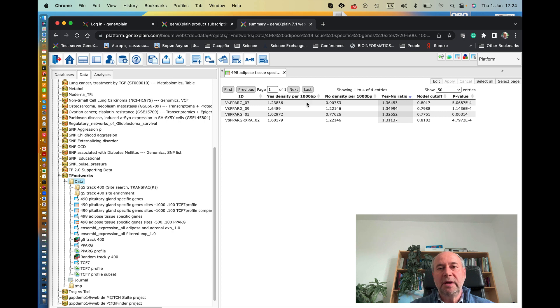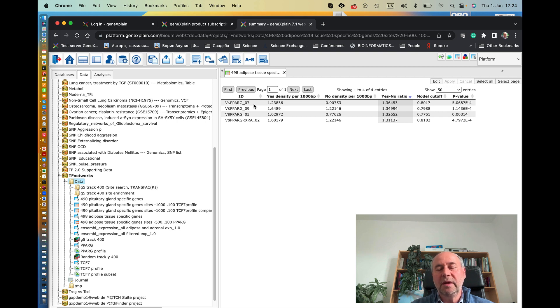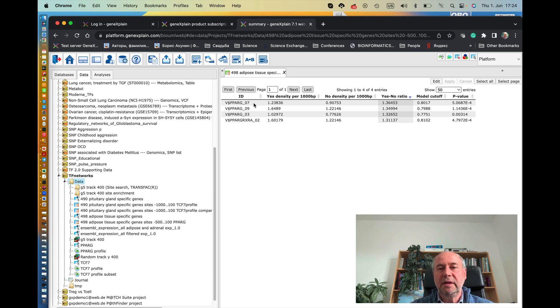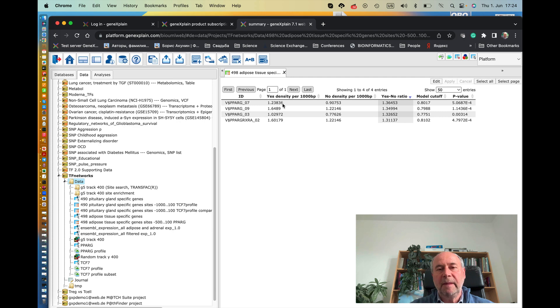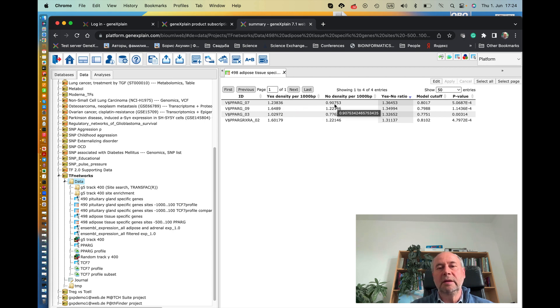You remember there were nine motifs. It found that four out of these nine motifs produce binding sites which are specific in the promoters of these genes. And for instance, this PPAR gamma 07 is very specific. So this yes to no ratio is 1.3 and p-value is 10 to the minus 4. So you can see this frequency of these sites in the promoters of adipose tissue-specific genes is indeed higher than in the promoters of housekeeping genes.